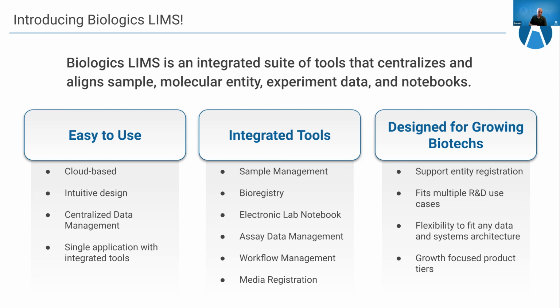Comparatively, our enterprise offering is aimed at organizations with a more mature informatics architecture and can be integrated programmatically into that broader landscape. It's for those organizations really looking for a central source of truth for their data that still supports system extensibility. We are fortunate enough in a few minutes to be able to hear from our very own Adam Rauch, who will take a bit of a deeper dive into what that means.